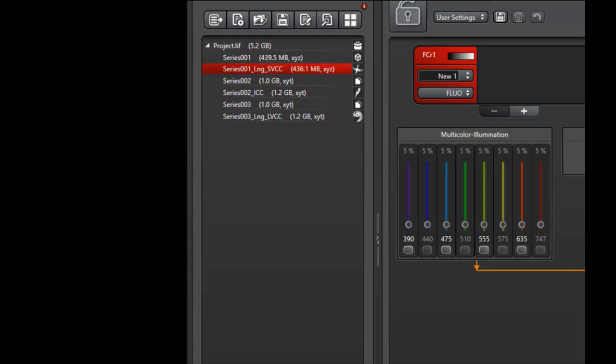Next to series 001, for example, you can see that it's an XYZ image indicating that it's a Z stack. Next to image series 002 indicates that it's an XYT image, so you know that this was a time lapse.